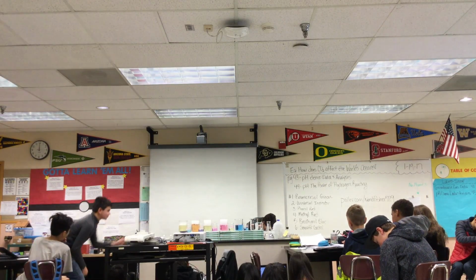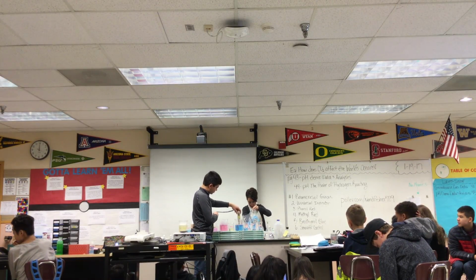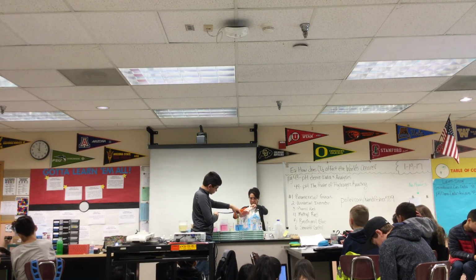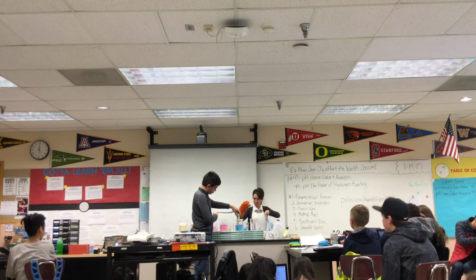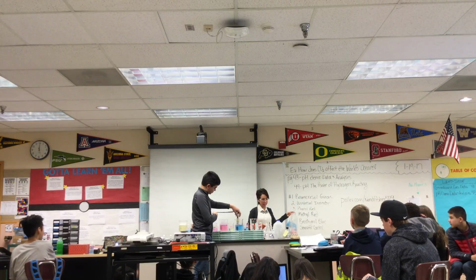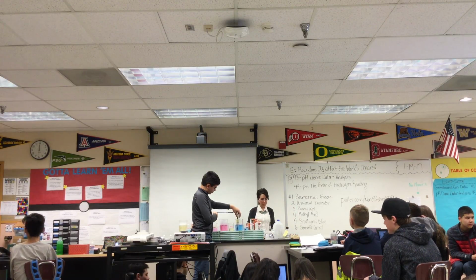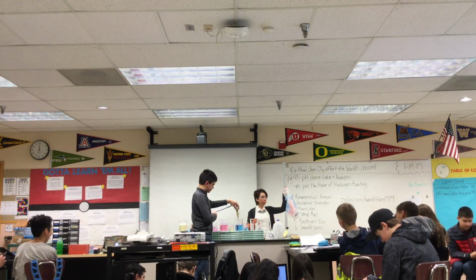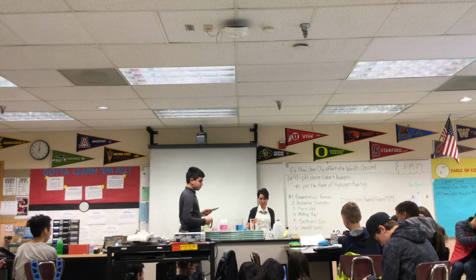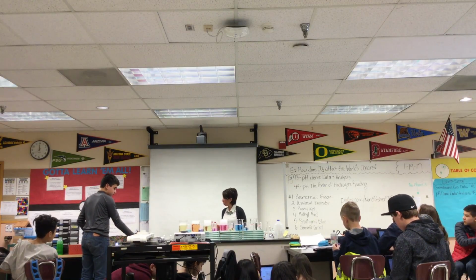So Xander, come up and find the pH of bromothymol blue. You just buy some bags. It comes in a block, and I used a hammer and beat it into small pieces. But yeah, 9.2. It's $1.49 a pound, just in case anyone cares to know. 9.2 for bromothymol blue.